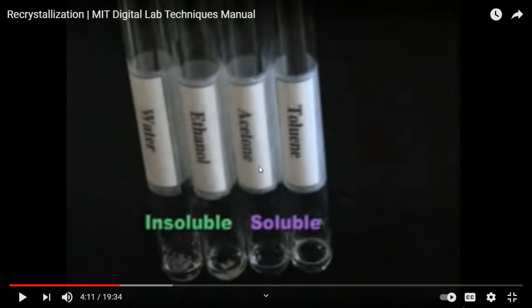Okay? So our procedure, book procedure, YouTube procedure from Professor A, Professor B, Professor C, they're all different. What the heck are they doing, right? They are doing the same thing. You learned one way of cooking, then if you really understand, you can cook in any other place, with any other ingredients. Because it's an unknown sample you are purifying. Okay? Unknown is unknown. You don't know what that is. You cannot follow the procedure written in the textbook. That mindset is a Gen Chem mindset. Now you are a real scientist.